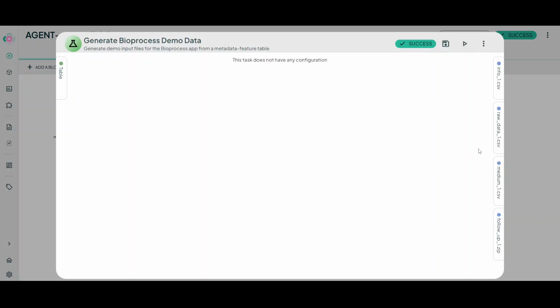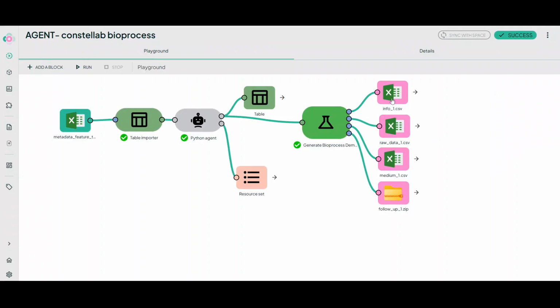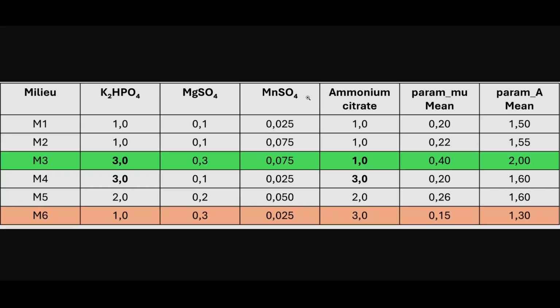Growth kinetics were simulated using a logistic 4 parameter model with growth rates and final yields intentionally designed to differ between media, so we can verify that the dashboard correctly identifies which conditions lead to the best growth. Before we open the dashboard, let me tell you what we built into the data so you can watch the analysis confirm it step by step.